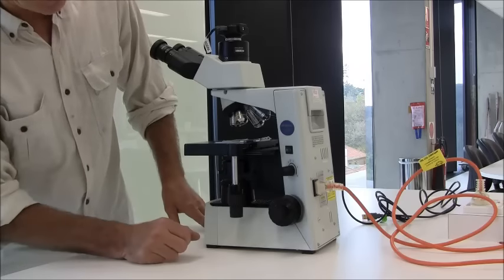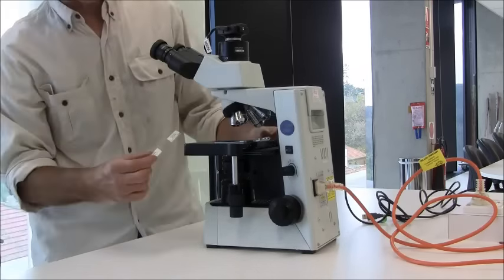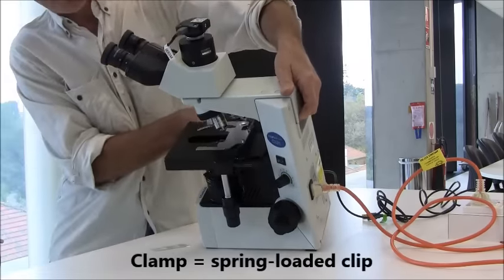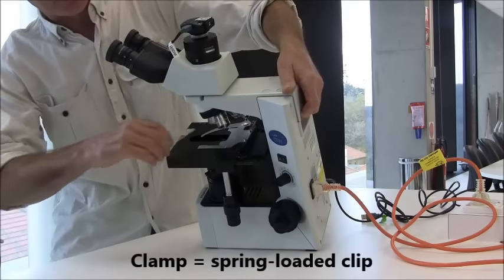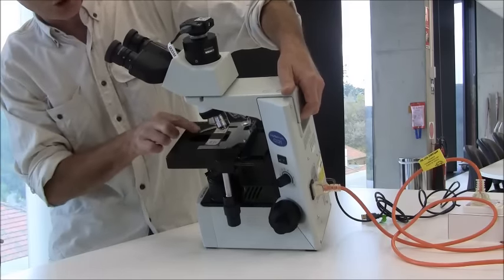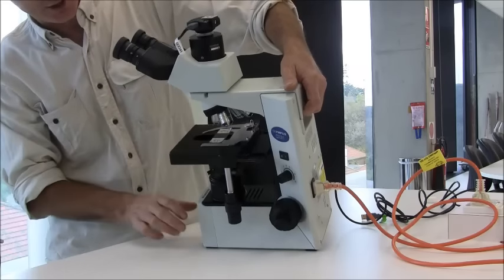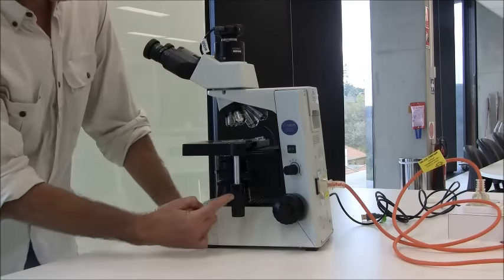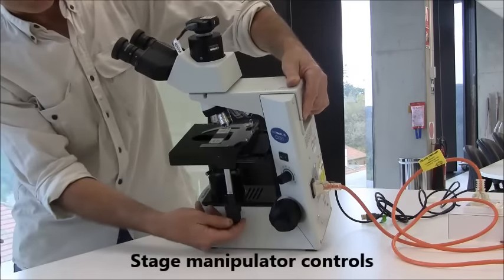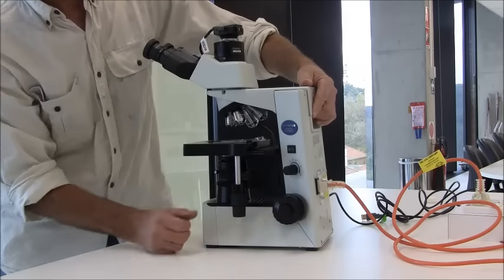Next, you have what's called the stage, where the microscope slide is clamped. Now, there is a clamp here where the slide can be securely positioned. A lot of students don't quite get it clamped in properly, so pay some attention there. And then these are the stage manipulation controls. You can move that specimen around, side to side, back to front, very accurately using these controls.